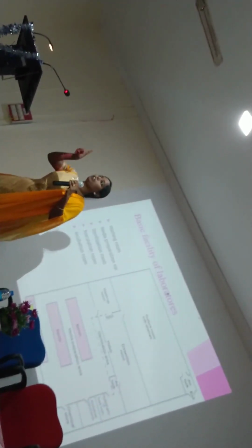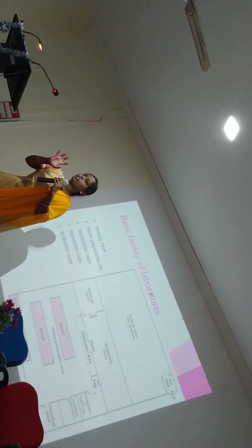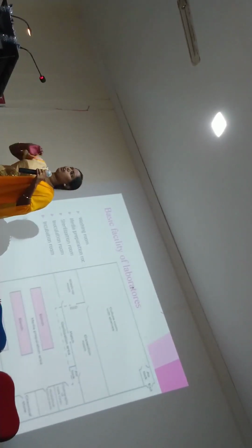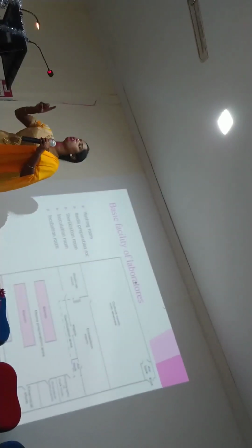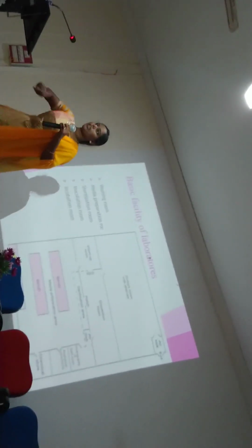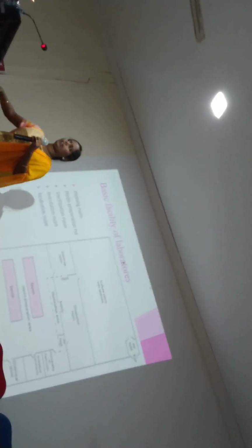should follow biosafety level 2 or 3. Why? Because they should maintain perfect sterile conditions. If we are not maintaining the sterile conditions, whatever work we are doing will become waste. So we have to maintain biosafety level 2 or 3. Biosafety level 1 will be maintained in the first rooms, the media preparation room and the sterilization room.